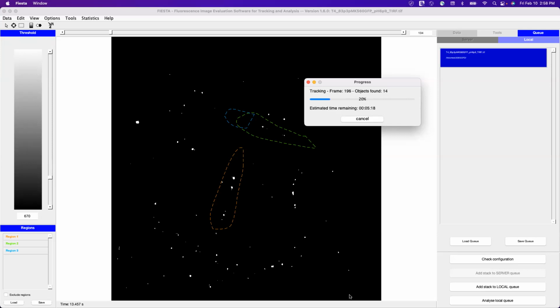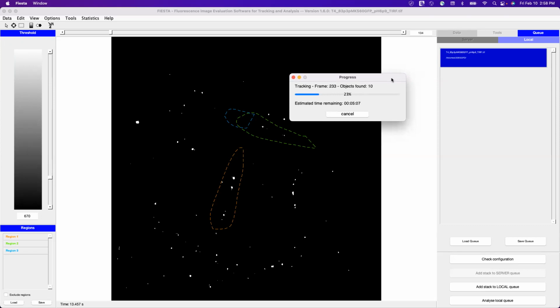We set the parameters to tell the software which is the same molecule in the different frames, and by setting that parameter, it will connect all those dots through the whole movie, and then it will give us tracks of a lot of molecules. Then we basically use those tracks, go into MATLAB and analyze it by ourselves because we know our data better than the software. It can analyze the velocity histogram.